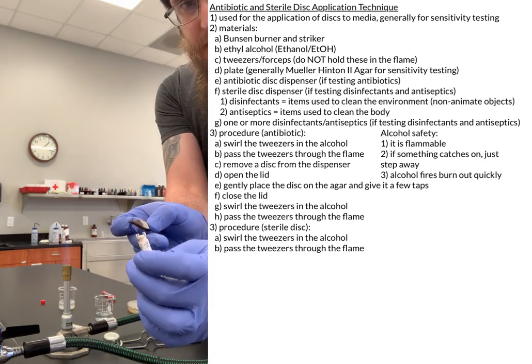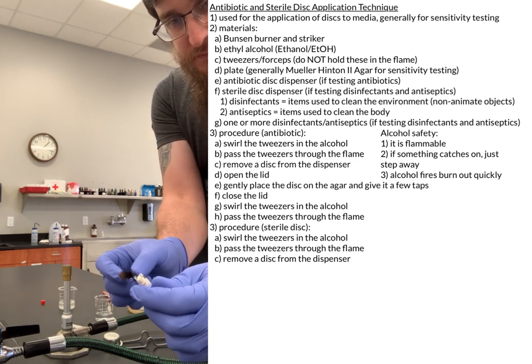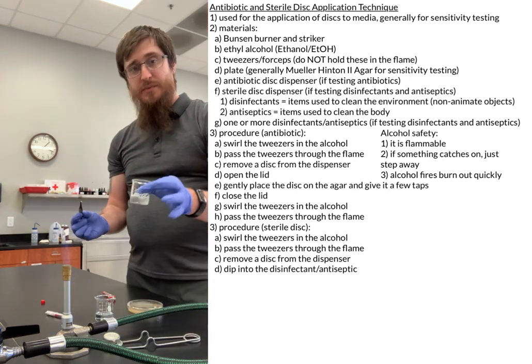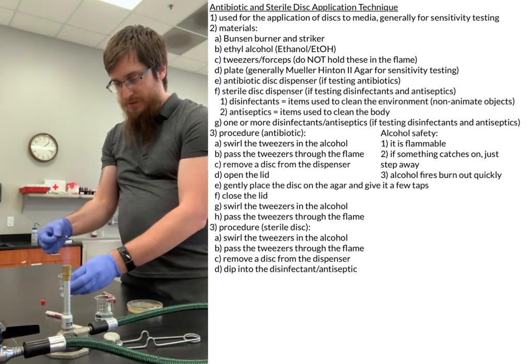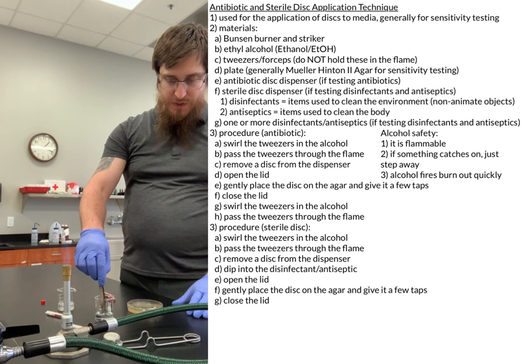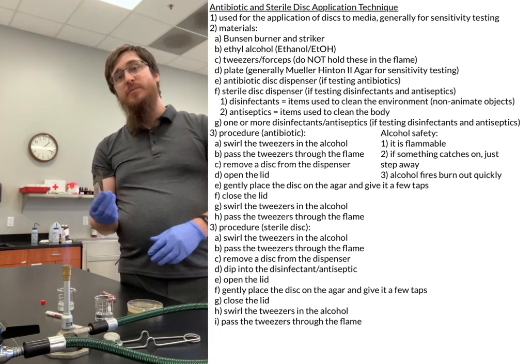I'm going to take my little disc here, and I'm going to try to push it to the side. If it wants to. Okay. There we go, I got my disc out of there. Now what I'm going to do is dip it into my disinfectant. So just give it a quick dip. There we go. Now we've added the disinfectant to it. And now I'm going to add it to my bleach area. Then I'm going to dip my tweezers in the alcohol, pass them through the flame so that they're now clean. And that is the way that procedure works.